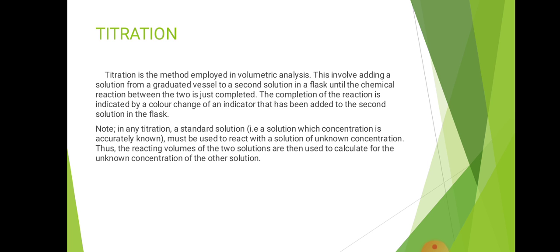I repeat again. You can only know when the reaction comes to completion as a result of color change of the indicator that has been added to one of the solutions. Take note of that. In any titration, the simple ideology is this: a standard solution is used to standardize a solution which is not standard.